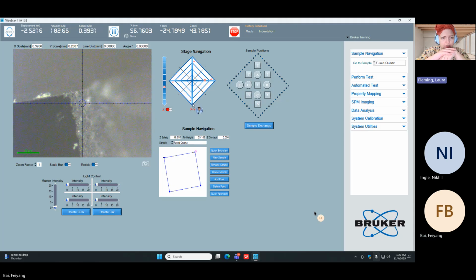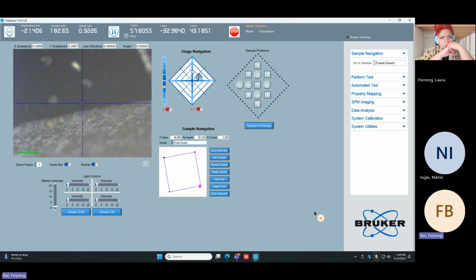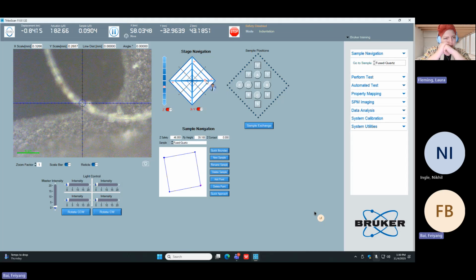All right, let's go ahead and go down. Okay. I think that this one's also good then. So I think we can go ahead and continue. Okay, our three things have been done.